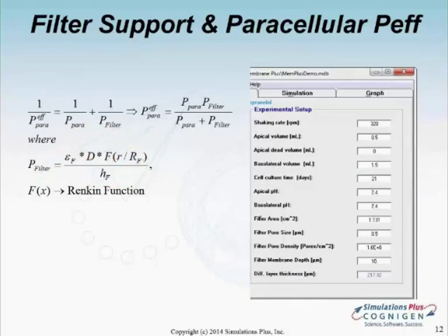When it comes to the parameters for the filter itself, these are system-specific parameters accounting for the pore sizes, pore densities, and these are parameters that you would be able to get from the manufacturer specifications for the inserts that you are using for your specific assay.